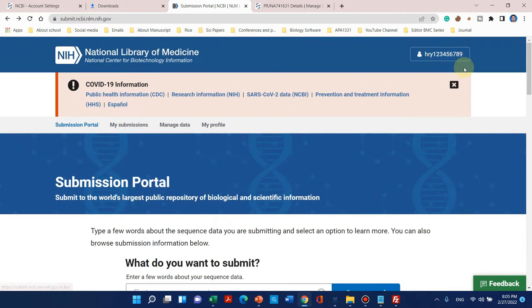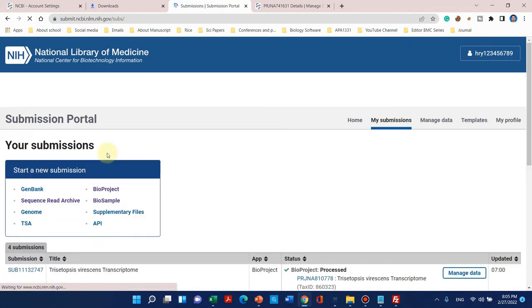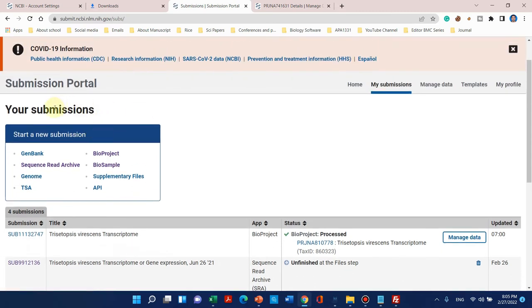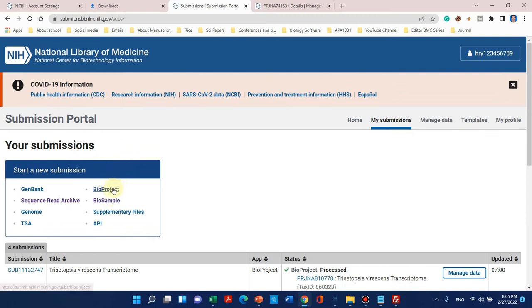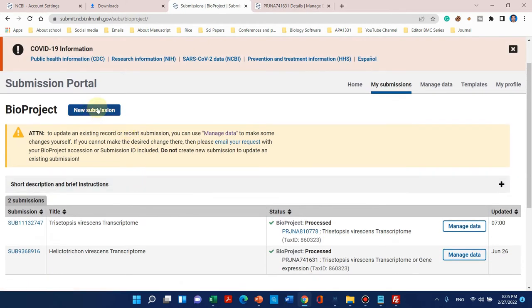After login, we can simply go to 'My Submissions.' From there, new submissions can be created: BioProject, BioSample, and Sequence Read Archive. BioProject is our third step, BioSample is our fourth step, and Sequence Read Archive is our last step. Now let's try to create a BioProject. When we click on BioProject, it will show that you can start a new submission.